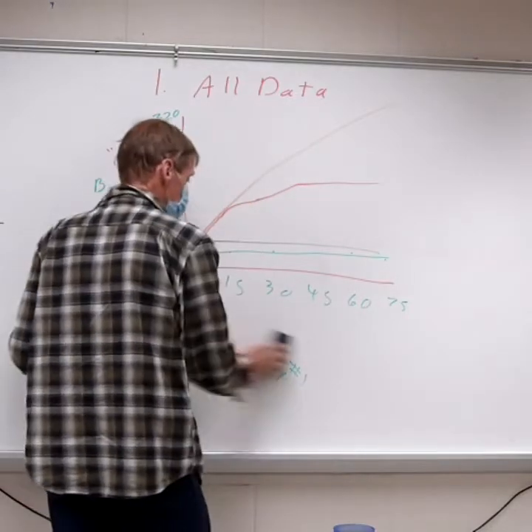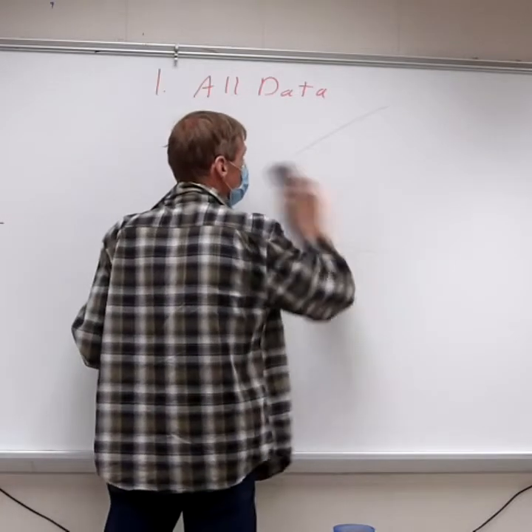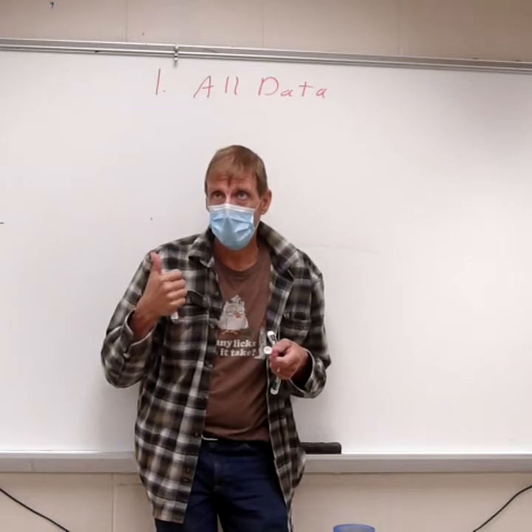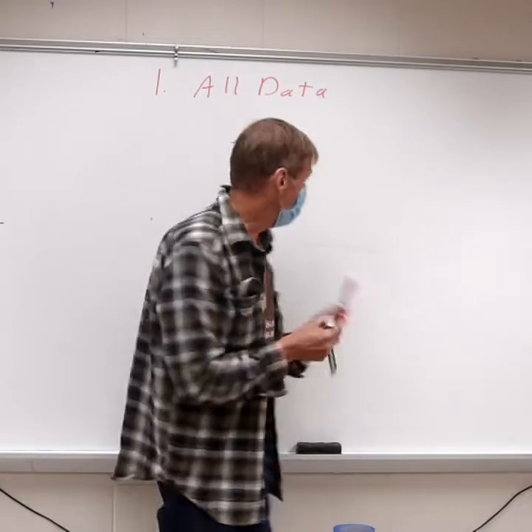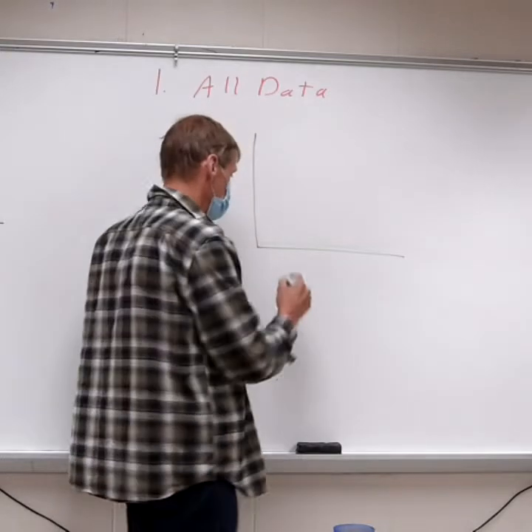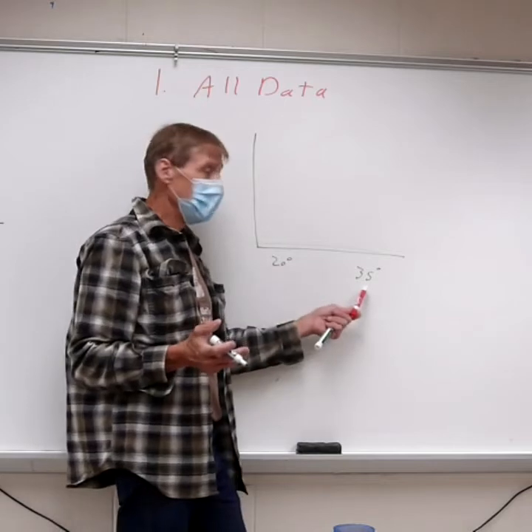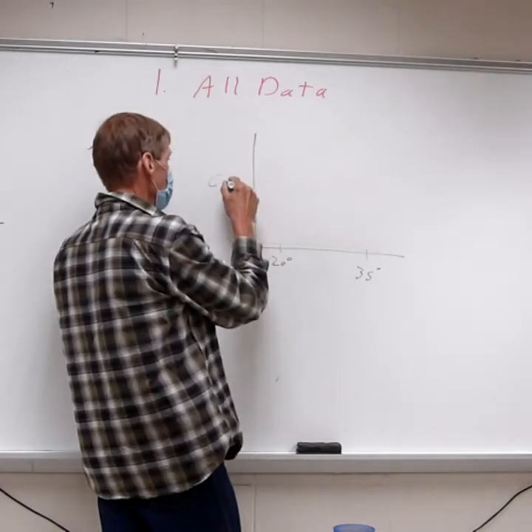The other 2, you have some options. It tells you to pick basically any of the independent variables, which for us I'd use, you don't have to, but you've got glucose or sucrose concentration, the sugar concentration, and you have temperature. Make a couple of bar charts. I think in the instructions it says make a bar chart. You have to average things together. For example, you had 3 balloons that we incubated at room temperature, 20 degrees, and you had 3 incubated at 35. So those are your 2 points here and here. Again, y-axis CO2.